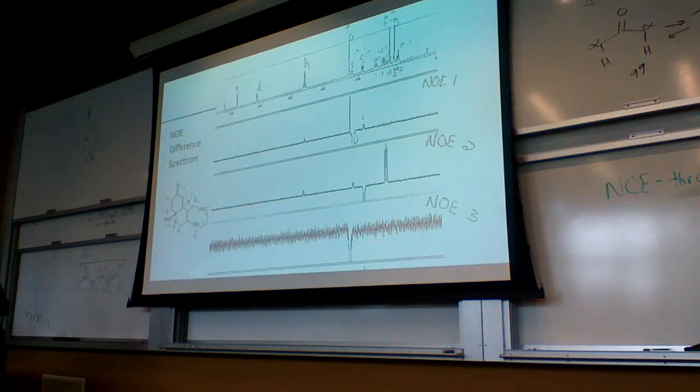Well, it's going to transfer that energy through that hydrogen getting excited into the excited state. It doesn't change the chemical shift, but it's going to change the population. Then when we monitor it, we're going to watch that relax back down, and that's where we see the FID, the free induction decay. So you let them get a little bit excited by irradiating the one, and then you see what else it excites in the molecule, and then we monitor what else is excited based on that one that we excited.